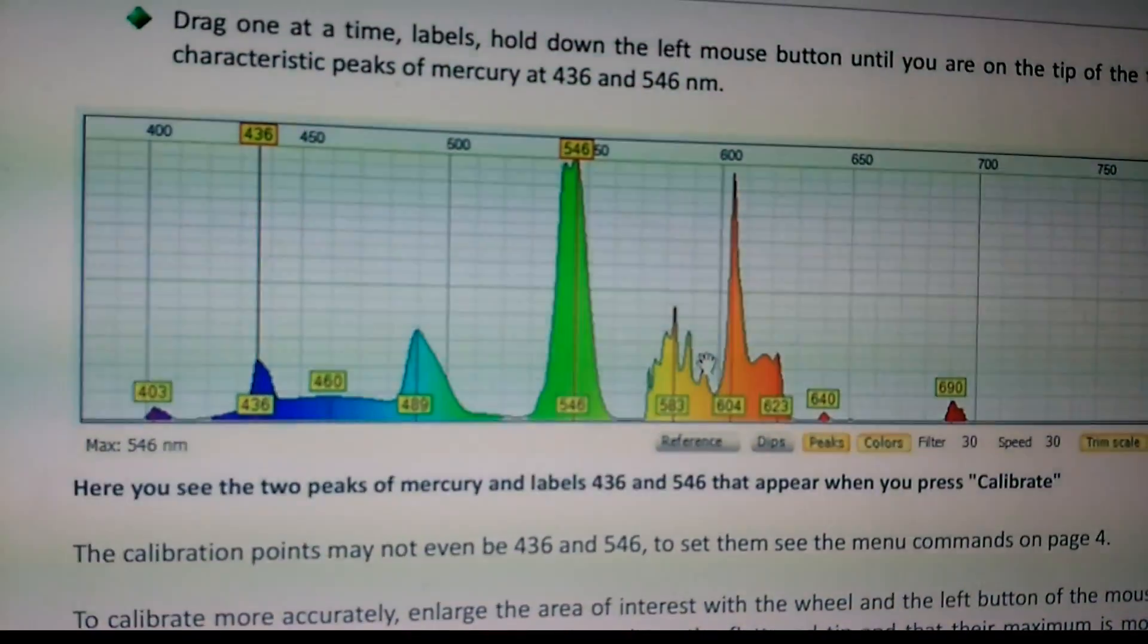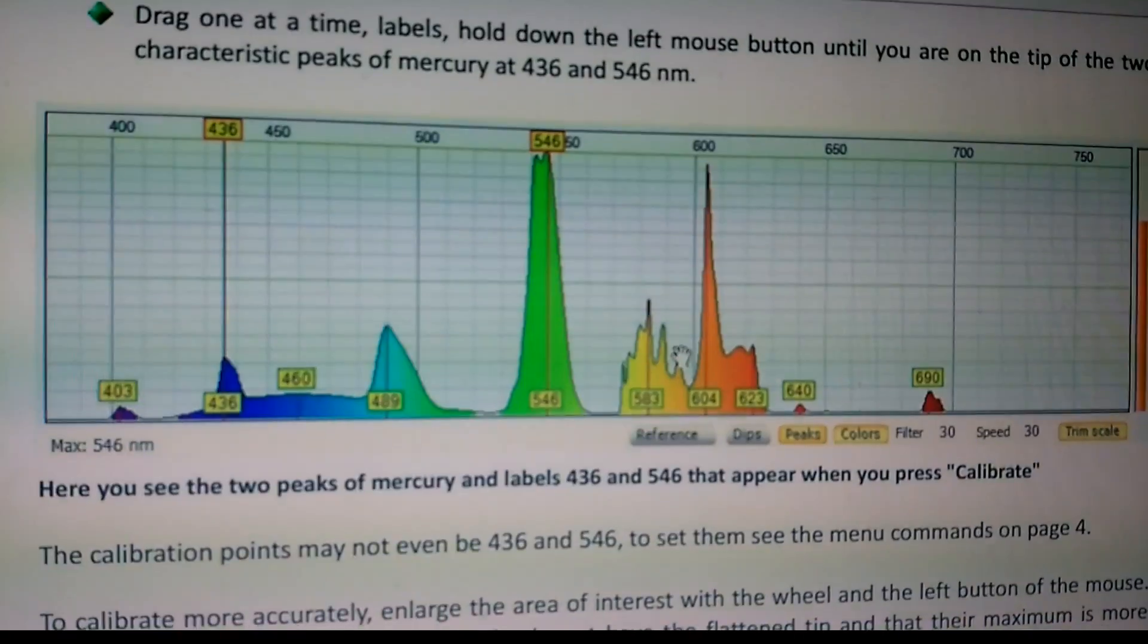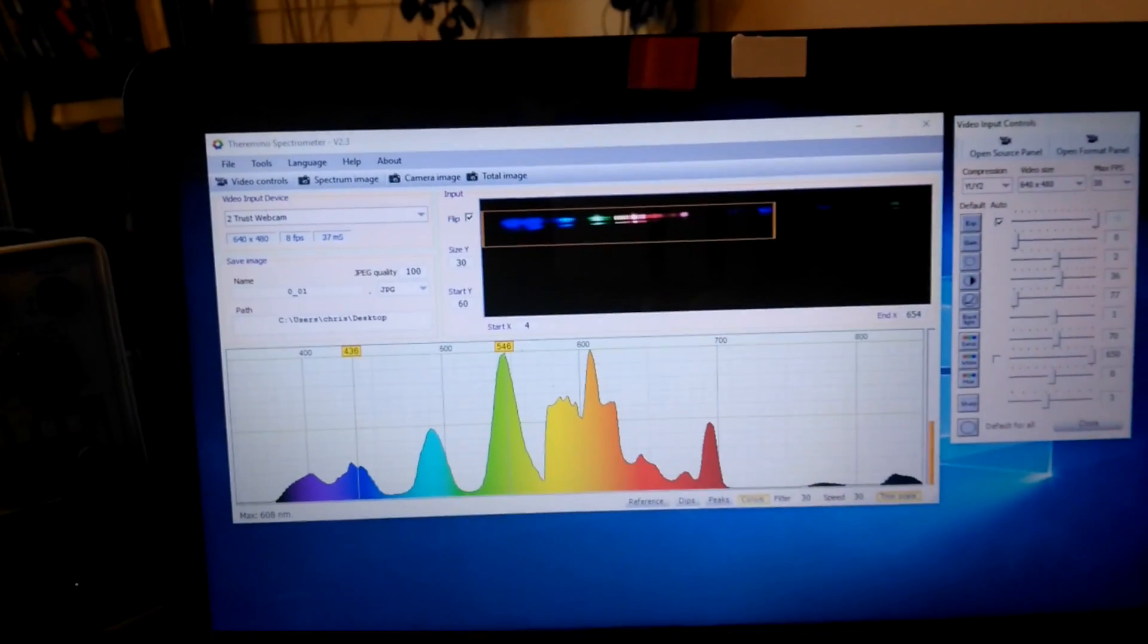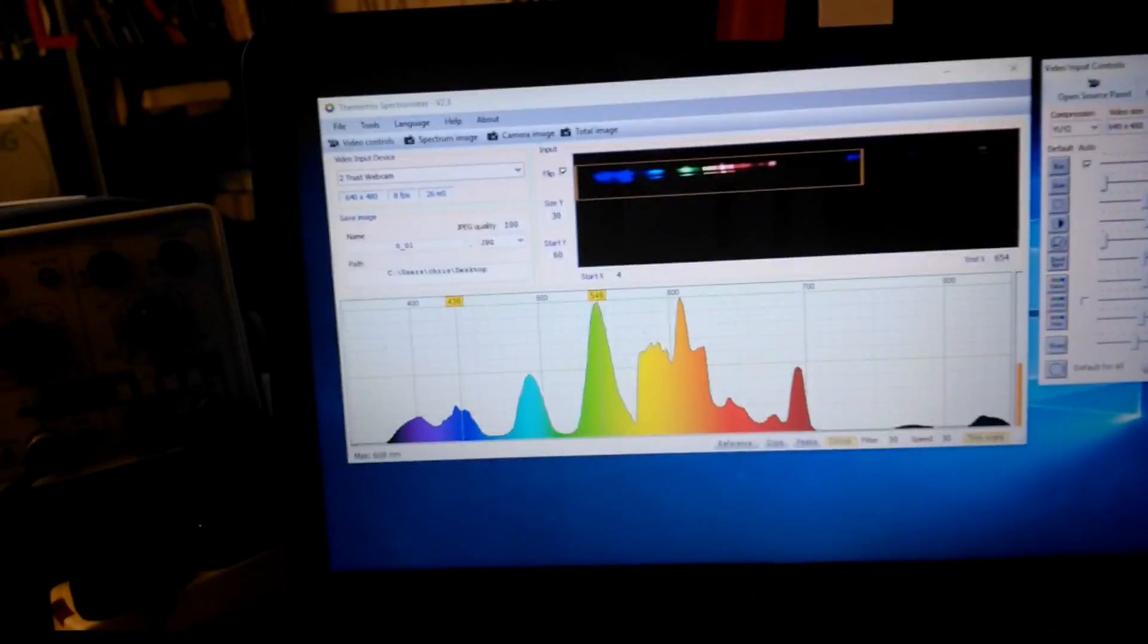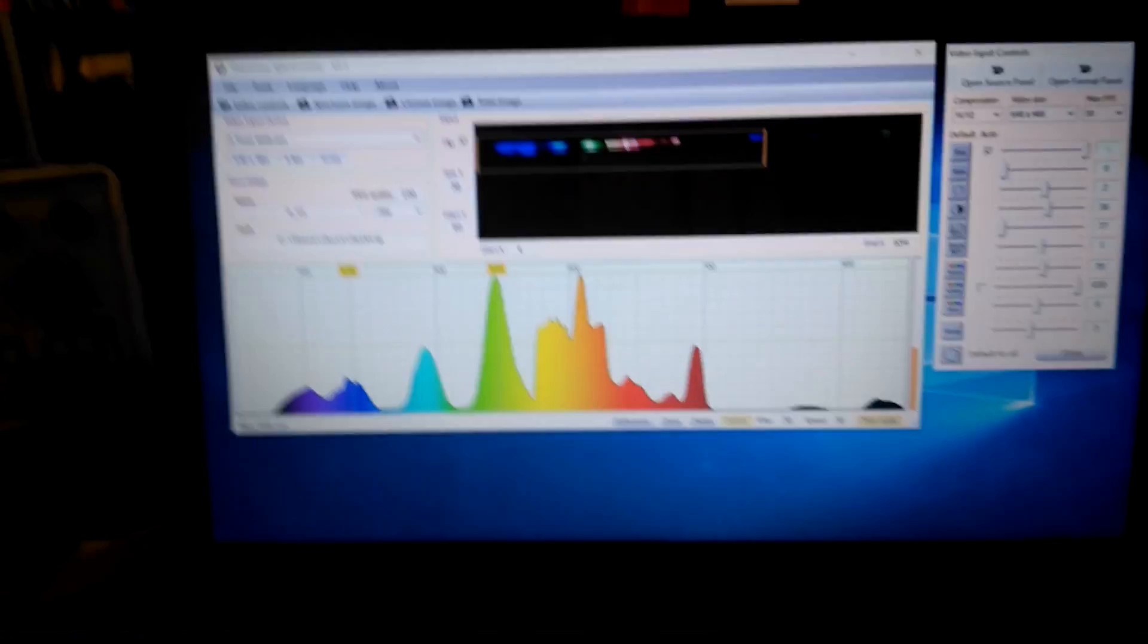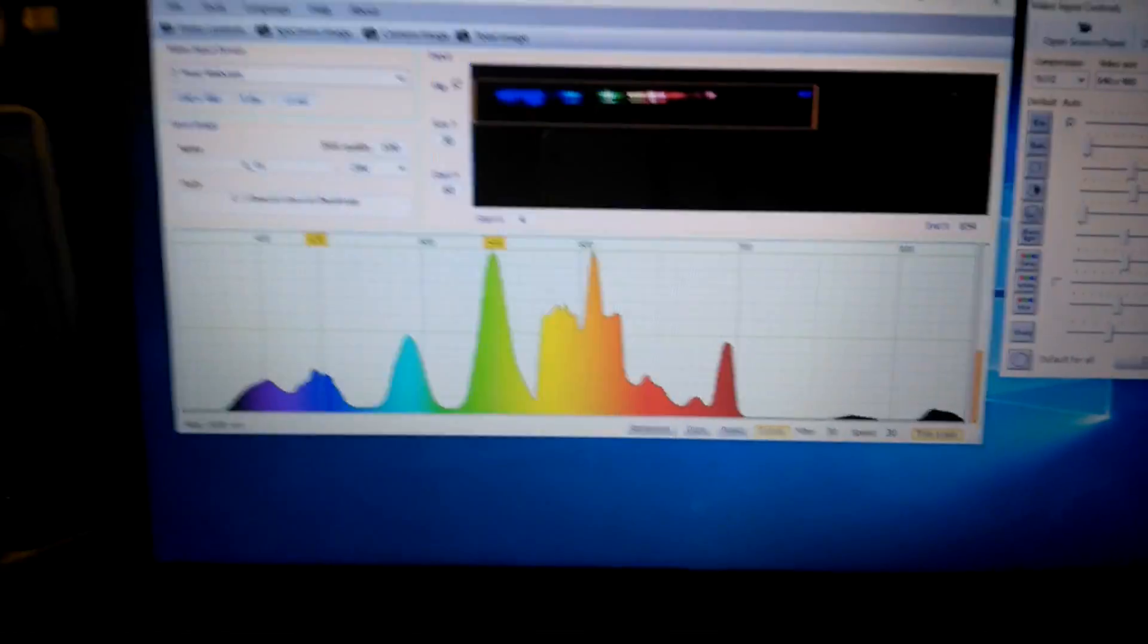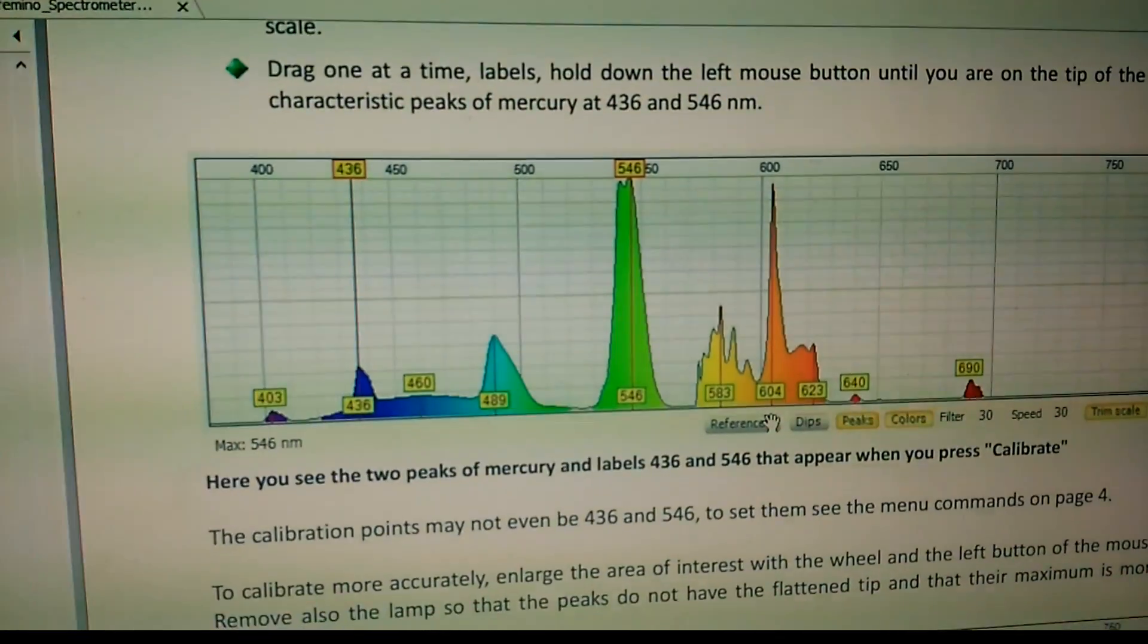This is the one, the reference in the book. And this is extremely similar. So what we have to do now is drag the reference lines to correspond with what we see on this reference graph.